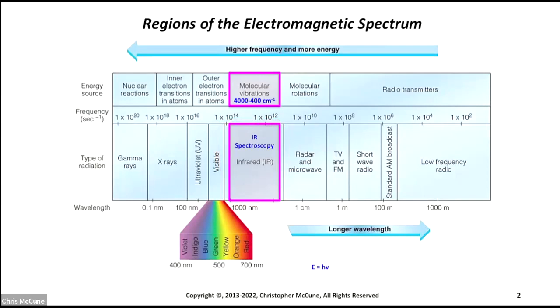Okay, so the IR region is just enough energy to allow bonds to start to vibrate, which means they're stretching and compressing, and so you can see signals based on that. And the difference in bonds between functional groups gives different signals along the axis of the IR spectrum, within sort of this range here.